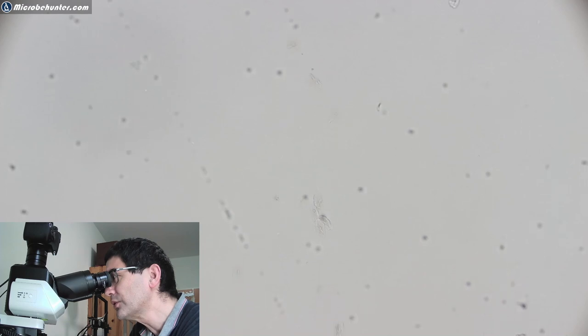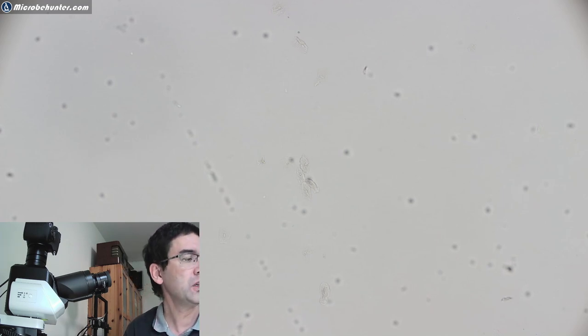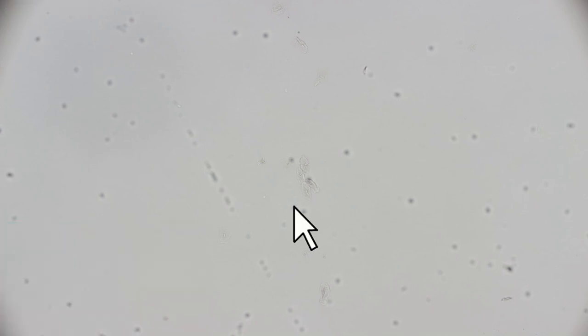And here we see already the first cells. No, you don't see it because the contrast is too low. Right in the middle. You know what I'm going to do? I'm going to switch over to include an arrow. Yes, okay. So all of those darker dots you just ignore. That's just dust and dirt.